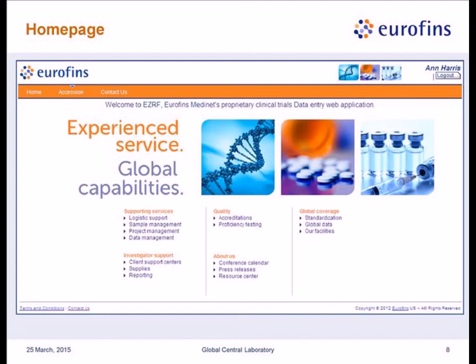Second option is the ship option, and third option is called the search option. We'll be talking about these three different options in this presentation in great detail. It is the accession button that you'll be using the most.